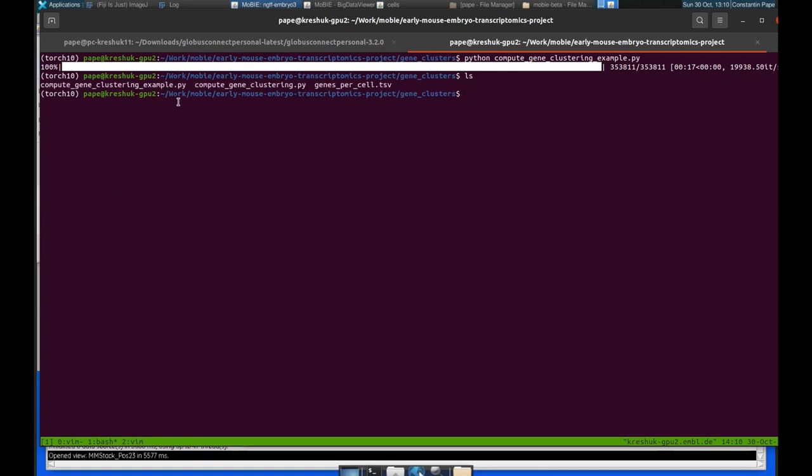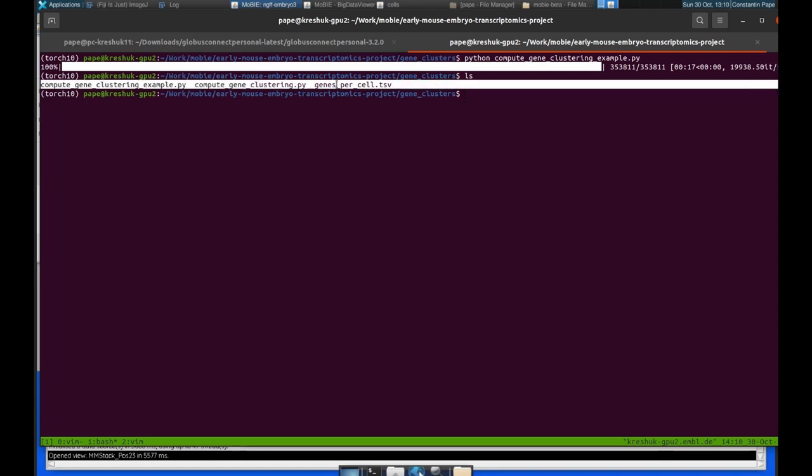Yes. And we can see that it has made this table, this genes per cell dot TSV. So TSV stands for Tab Separated Values. And it's a specific format for tables that Mobi supports. So let's see what's inside of that table.